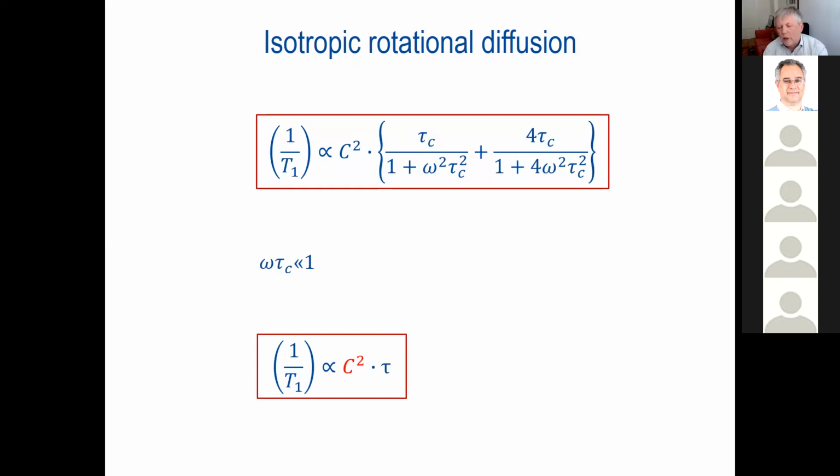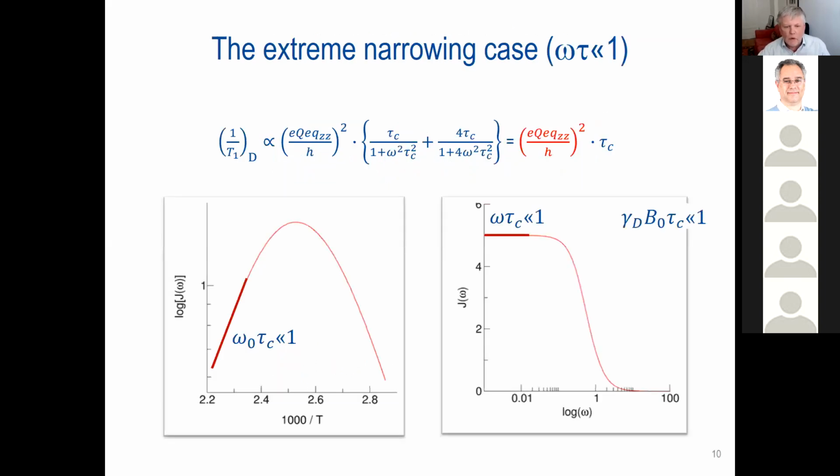So sometimes it can be that you don't see any dispersion, let's say at higher temperature, and only at very low temperature, dispersion behavior shows up. And then it's very helpful to have a good suggestion for the coupling parameter, where you start with if you try to fit your equations. Okay.